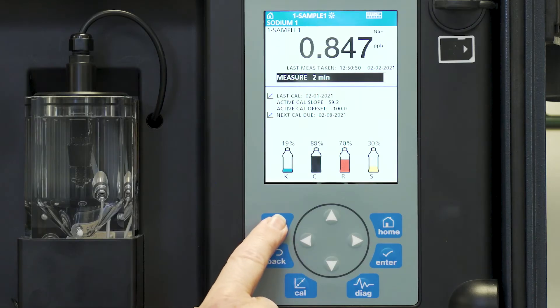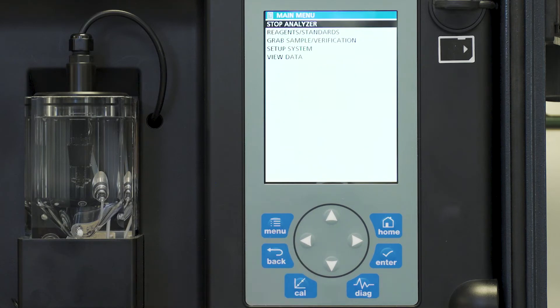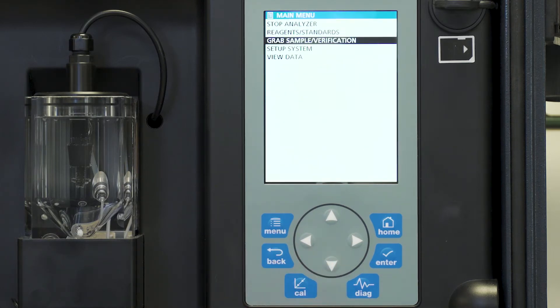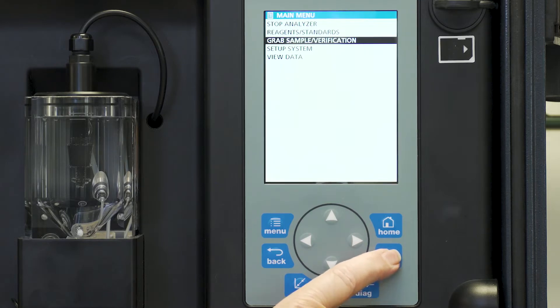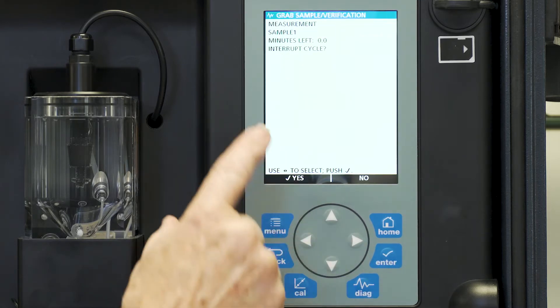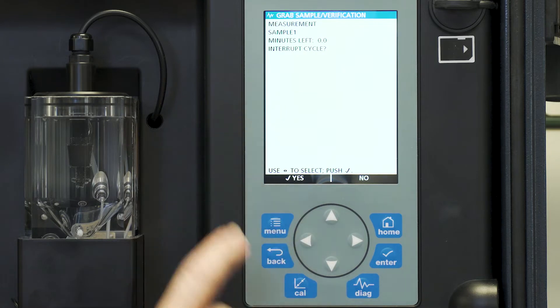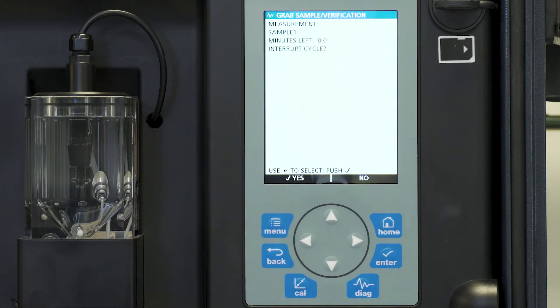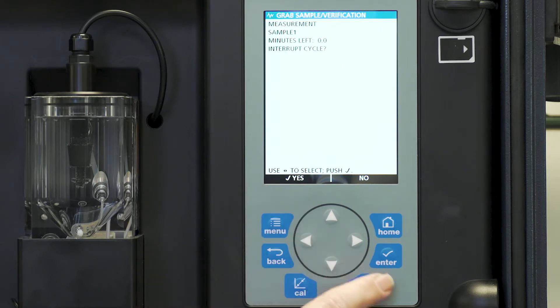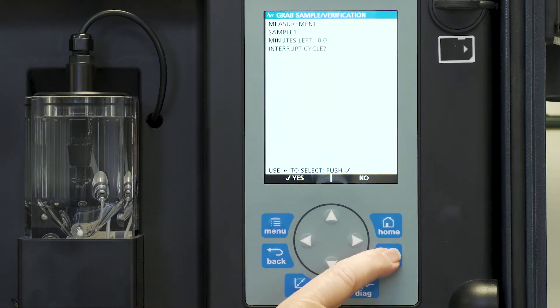First go to menu and we move down to grab sample verification. You will notice that it's currently in a measurement mode. We want to interrupt that mode so we can go directly to our grab sample. So we're going to choose yes and press enter.